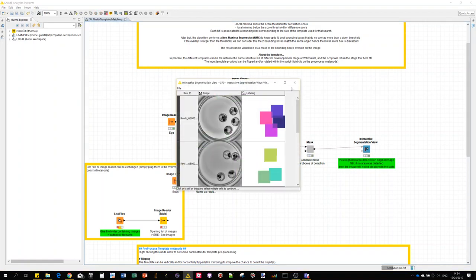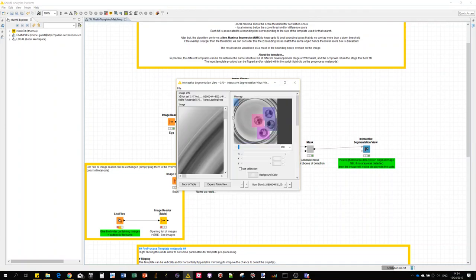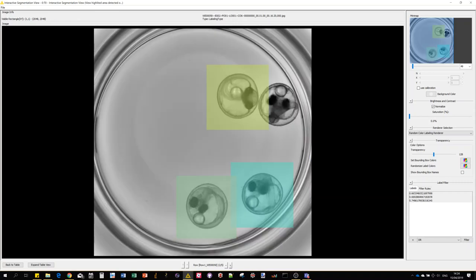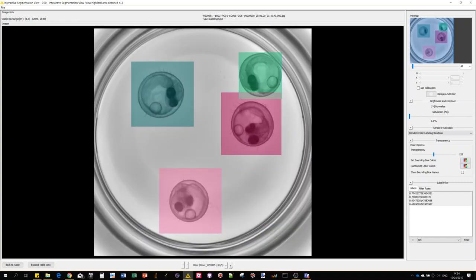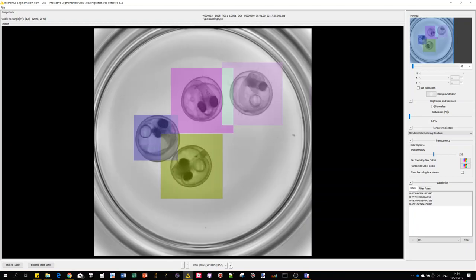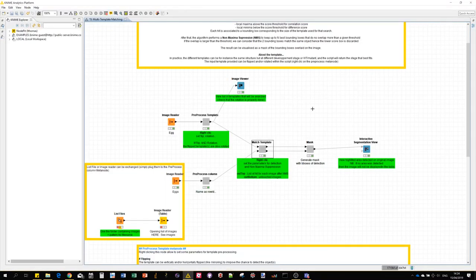Okay, here we go. So again, just click on the image to get the overlay, and as you can see it nicely worked in most cases. I think that's it for the KNIME implementation.